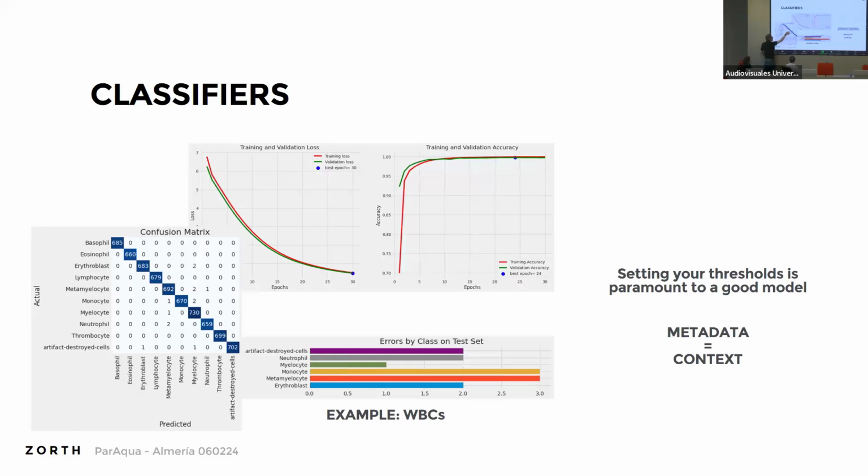They land outside of there. And in this type of representation, you will very often get some bands here of lighter blue. And that is basically when something on training and validation loss, which I will come back to later, is abnormal. And look, here is your epochs. That's basically your accuracy as a function of the number of epochs trained. Training and validation loss, they should be as close together as can be. So we're going to see that.